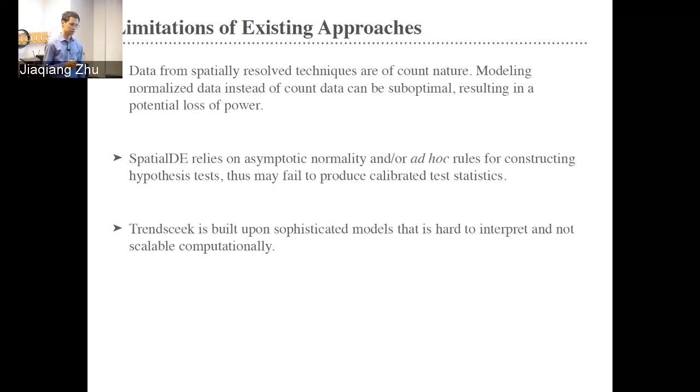Do either of them take into account replicates? Which method? Either one of them. It's for one sample, because for each sample, there are multiple cells or multiple spots. So far, there is no method focusing on multiple samples. I think most samples are also suffering from batch effects, and also because if you get a tissue section, then you get the relative location for each spot or each cell. But if you have two samples, then how do you combine this? Yeah.